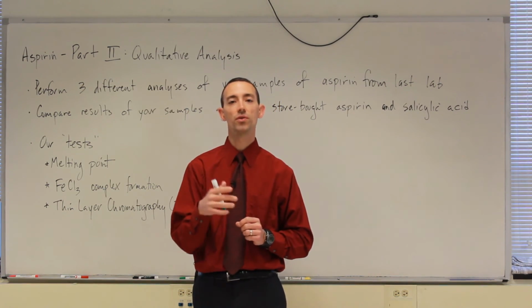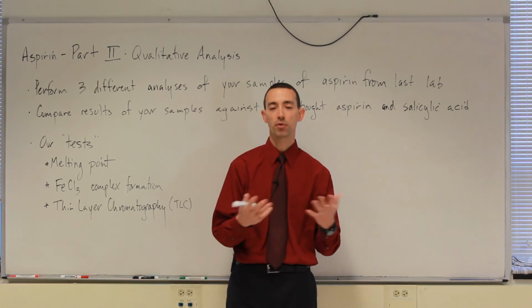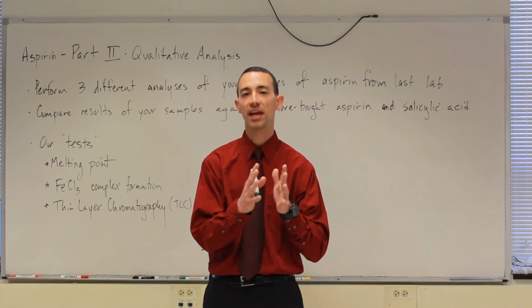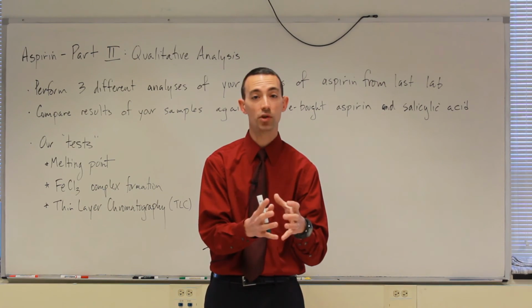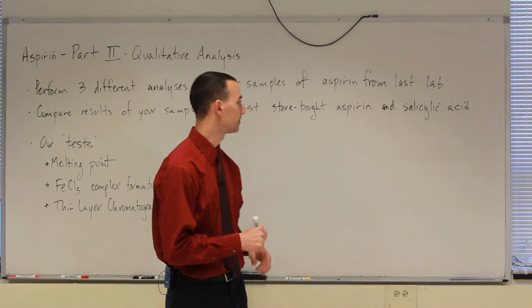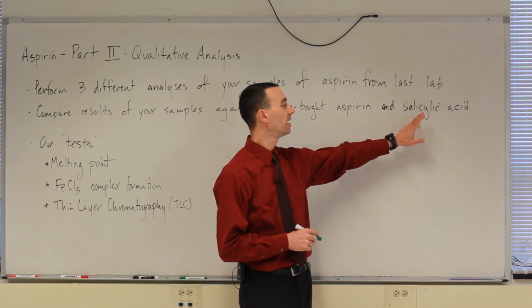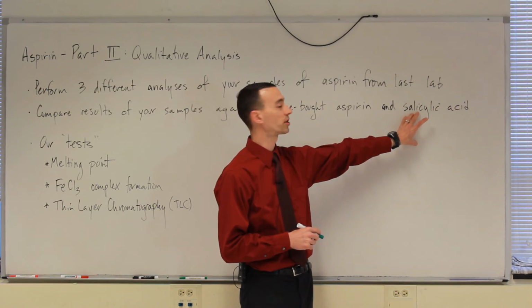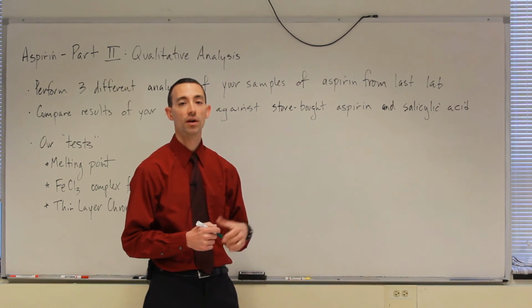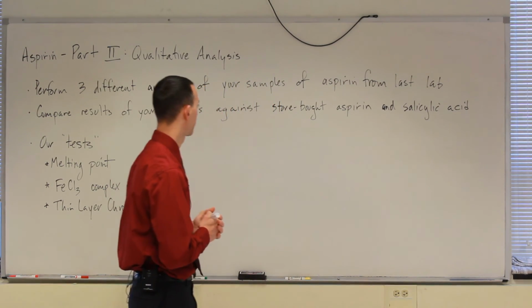Any adjectives that you can think of to describe the crystals and the products would be great to help you convey if they look different as what you believe is aspirin versus the salicylic acid that you started with. So you really need to do that same thing about gathering details and descriptions for the salicylic acid as you do for your aspirin samples, raw and recrystallized.